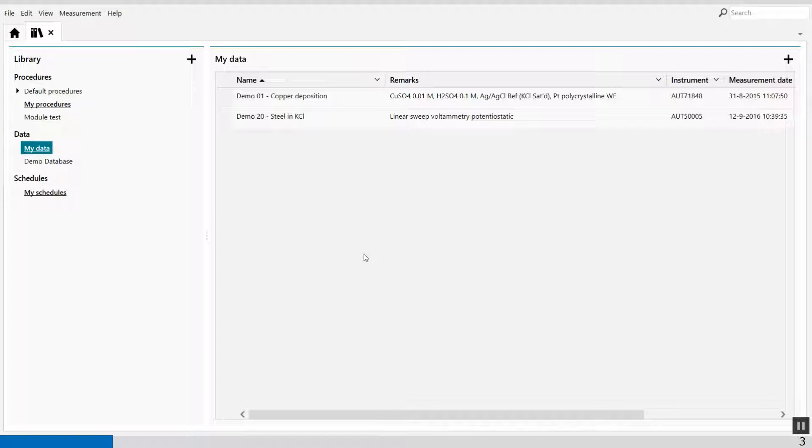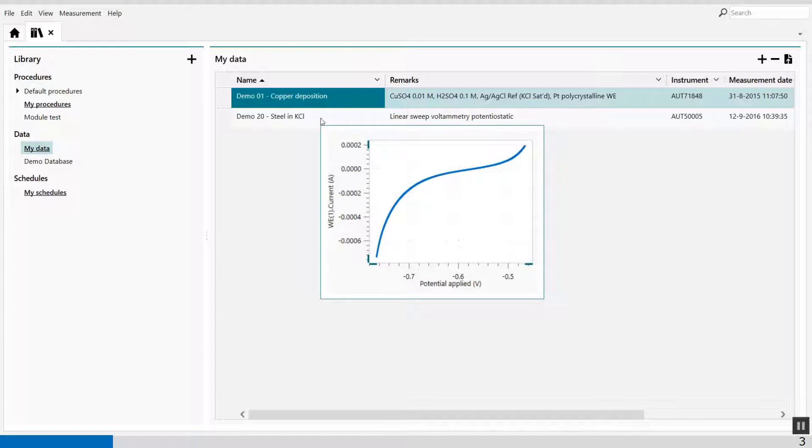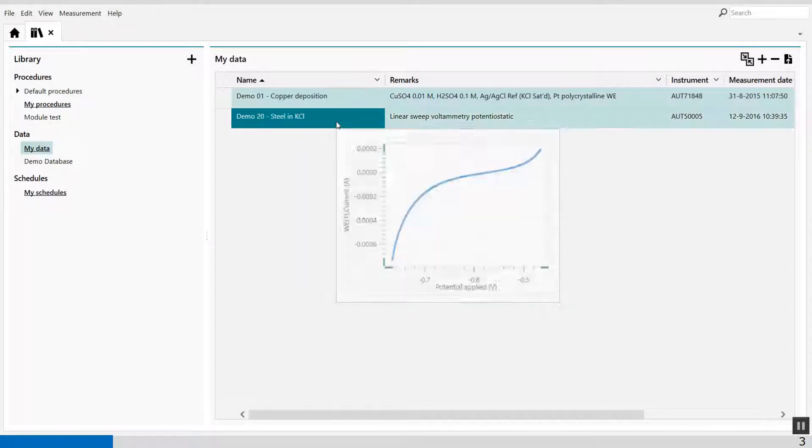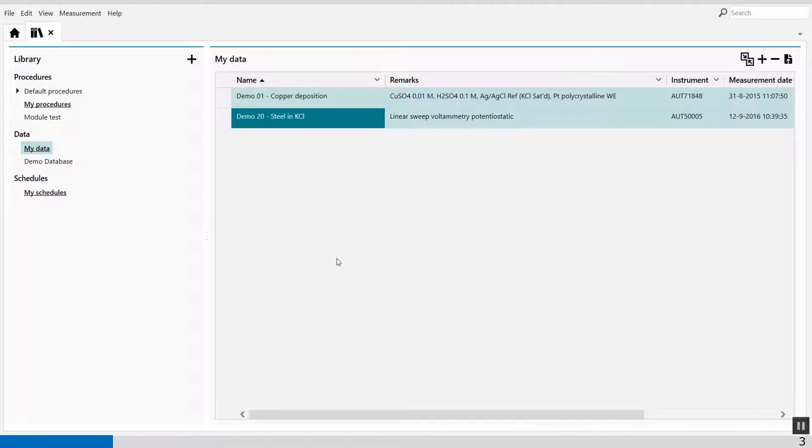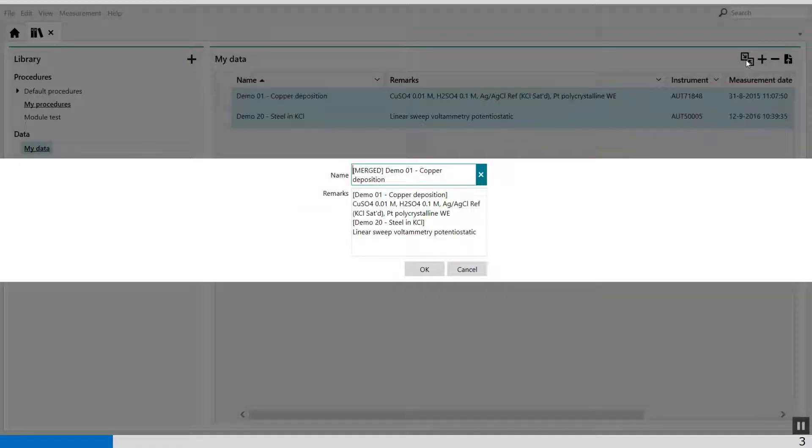Well, how do I merge these two? First, I select the first file, and then I hold my CTRL key. So I press my CTRL key, and at the same time, I select the other file. You will see, in the right upper corner, an icon available which says Merge Data.